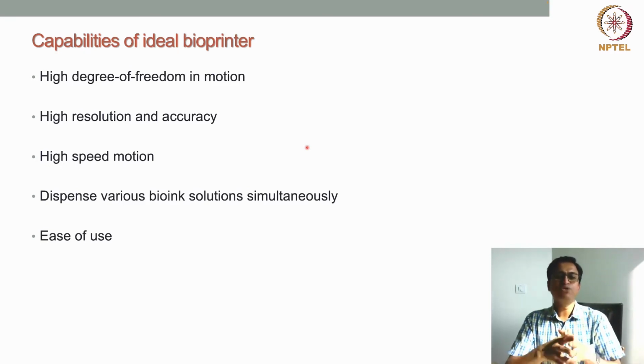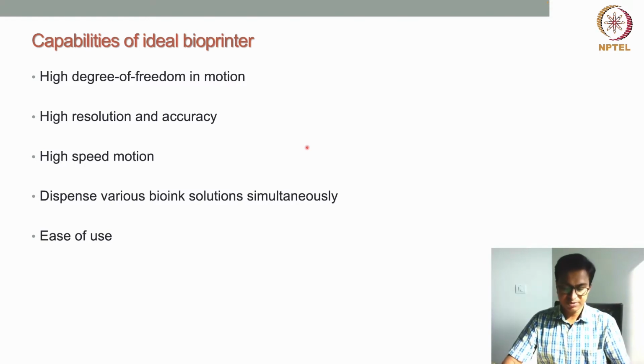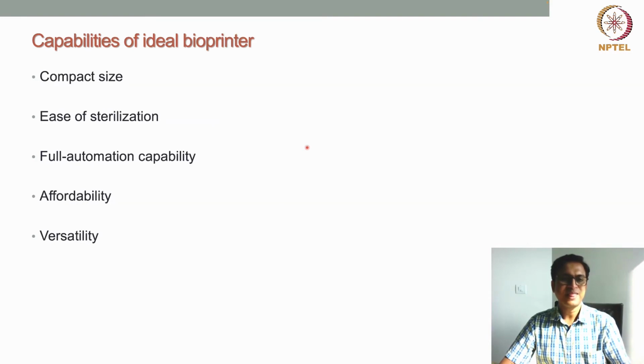the ease of use is definitely a common requirement for easily translating this bioprinter for different applications. Other thing is the bioprinter should have compact size.